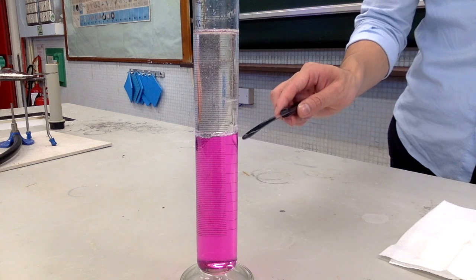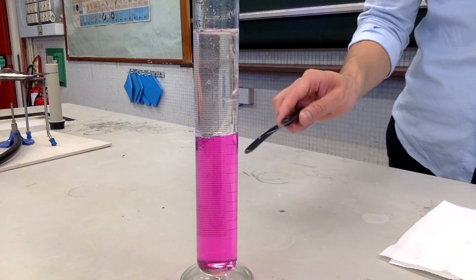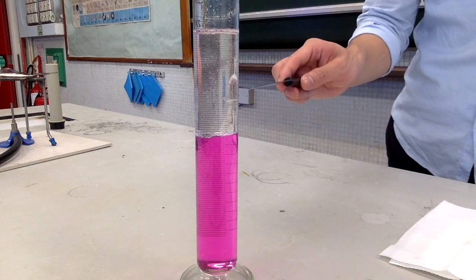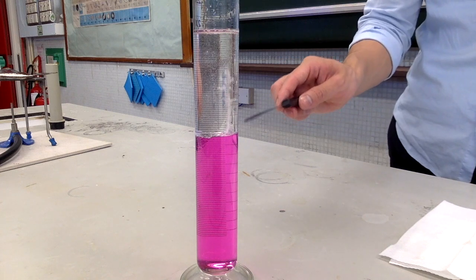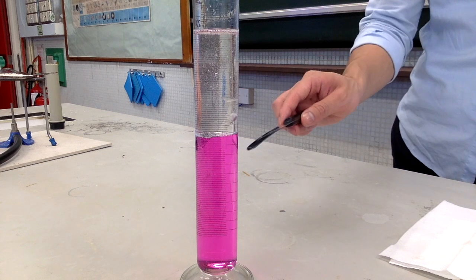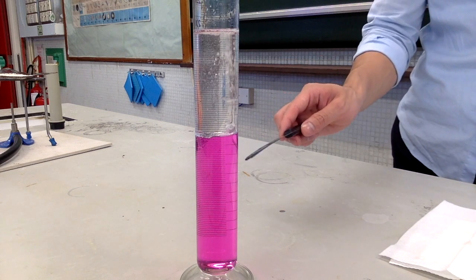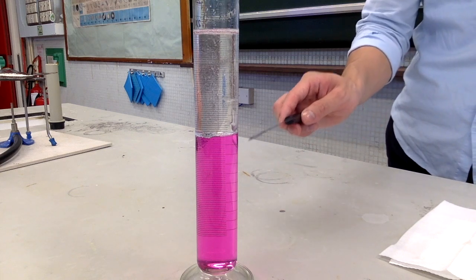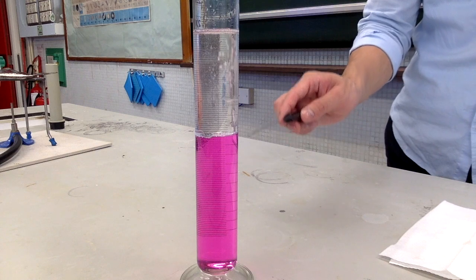Now, you also notice a very distinctive color change in the water layer. The solution changes from colorless to red or colorless to pink. The reason is because the reaction between sodium and water also produces sodium hydroxide. And sodium hydroxide dissolves in water to form an alkaline solution, and therefore turns the color of the phenolphthalein from colorless to red or purple.